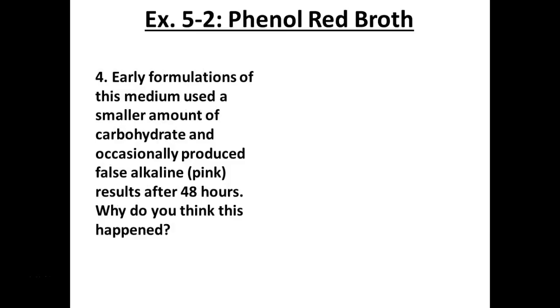Early formulations of this media contained a small amount of carbohydrate. So that would be a real problem for Jessica's organism, right? Because after 48 hours, it definitely had moved on to eating the protein, right? So we wouldn't know that except for maybe the gas bubble may clue us in that, oh, sugar fermentation probably happened, but why is it not yellow? Well, because he's moved on to the protein.